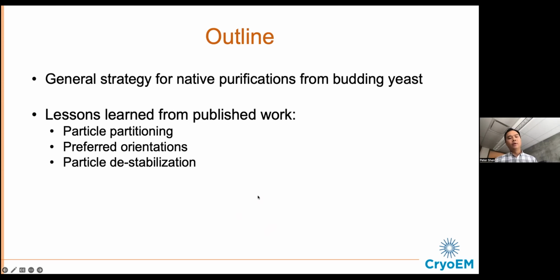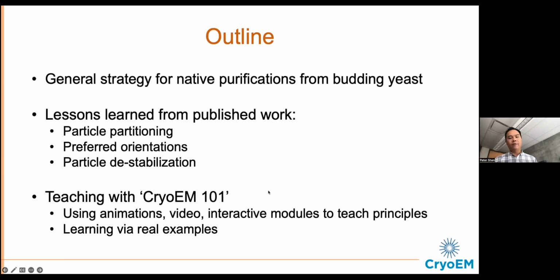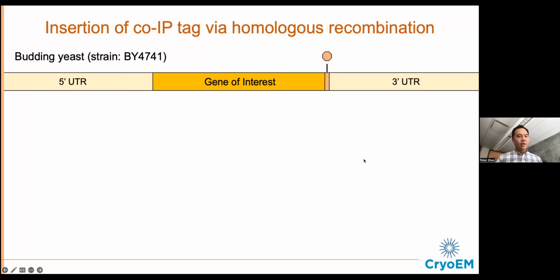And finally, I'll switch gears by sharing our efforts to teach cryo-EM principles and help newcomers calibrate their expectations, through our development of this cryo-EM 101 course that Mike alluded to in his intro. So to start off, a very brief overview of how we isolate native complexes from yeast.